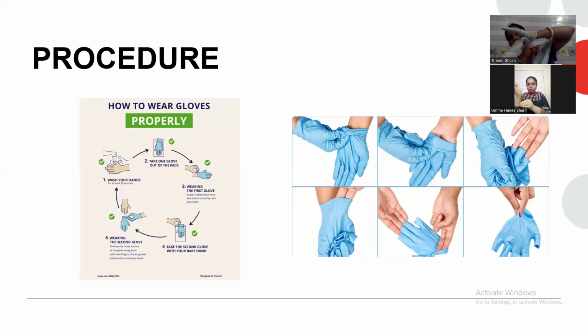Yes, pinch a little, and then push your finger like this. Okay, let me see first, then I will do it. Just pinch, and then grab it and open it. Just try it first.